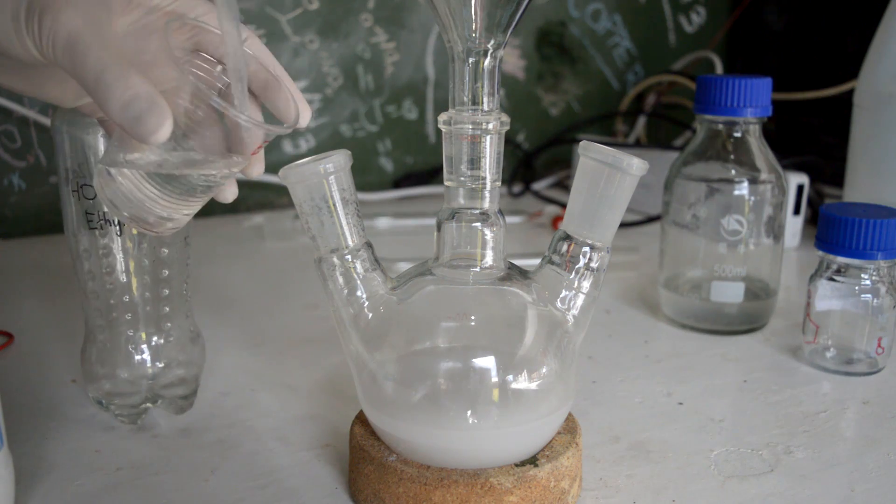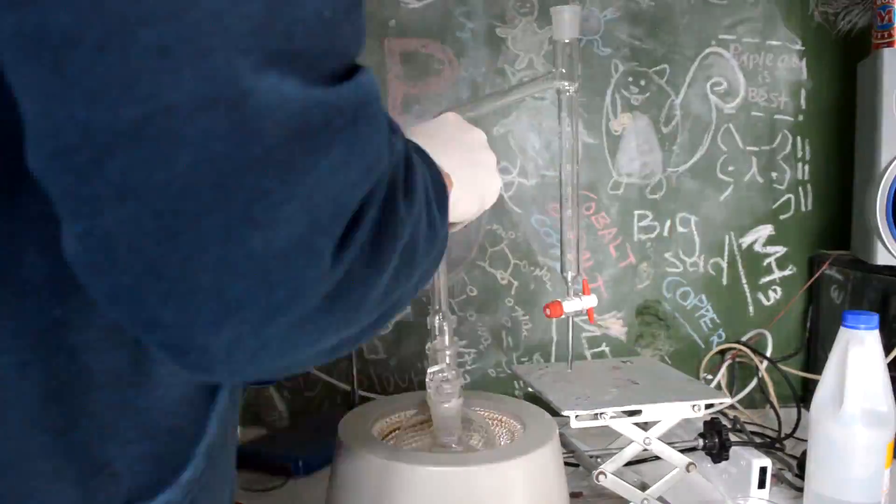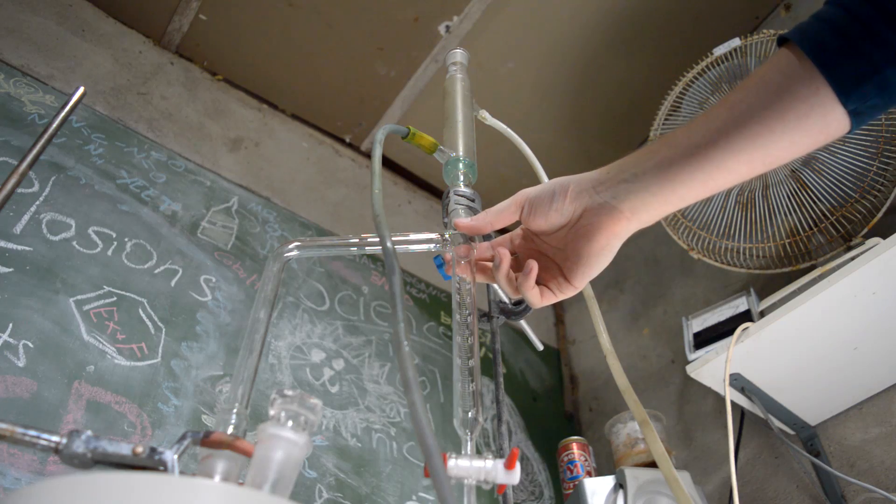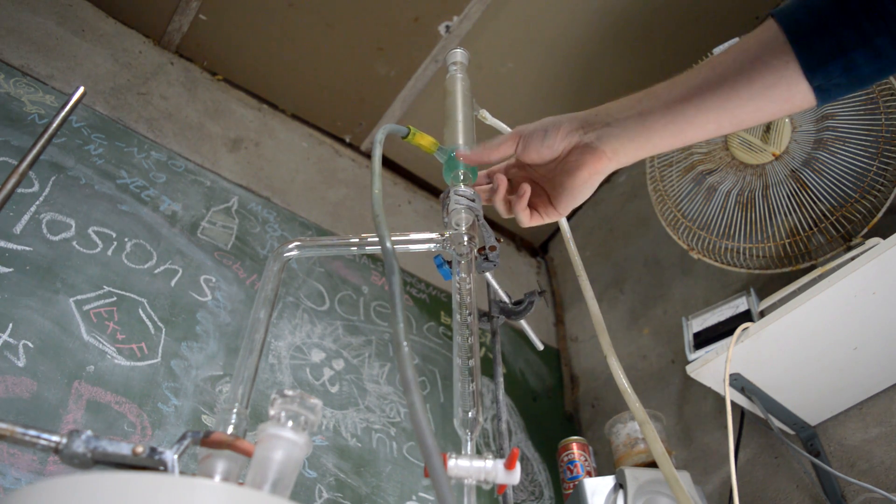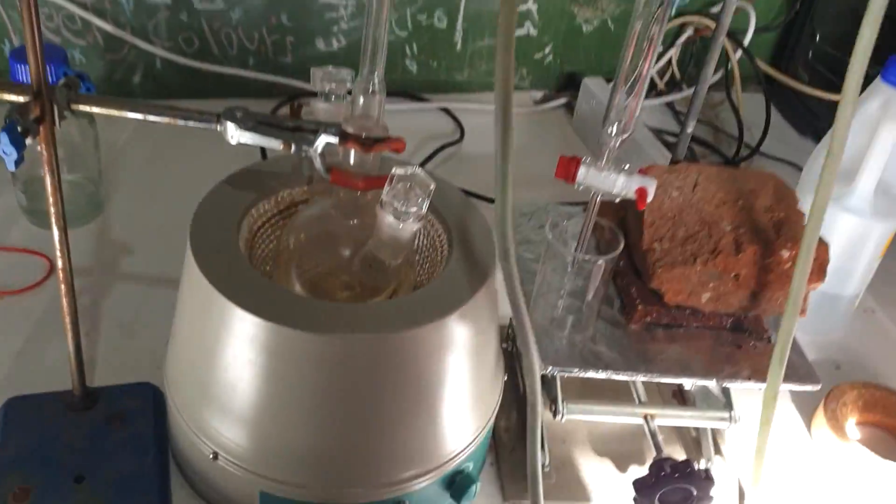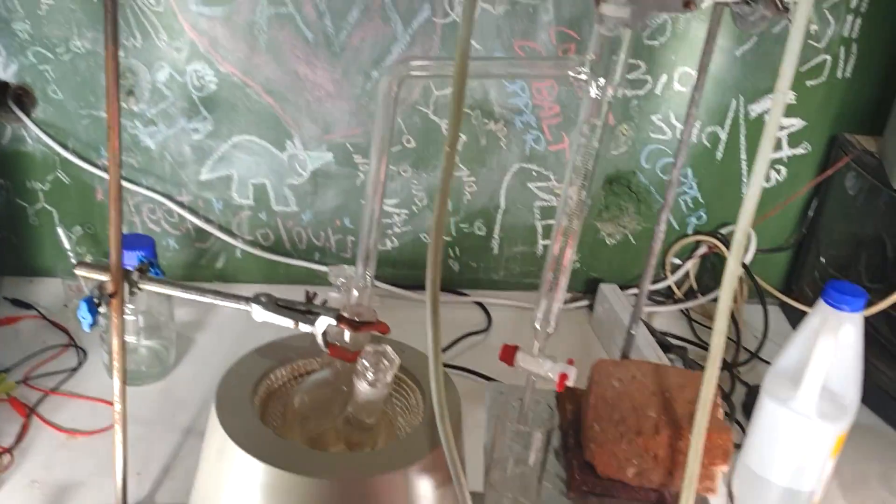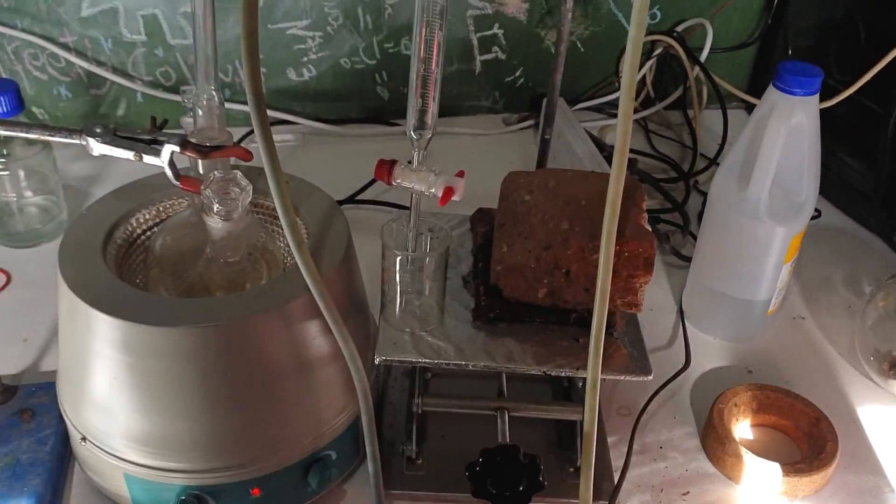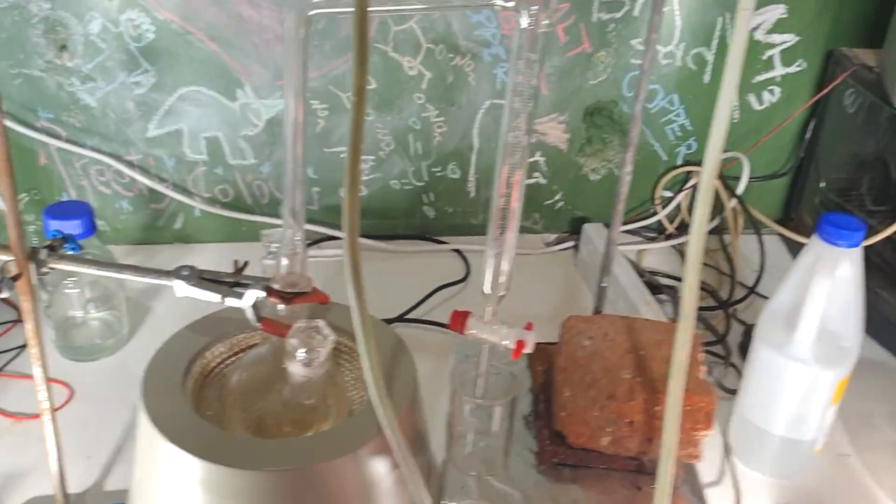Everything's assembled. It's a little scary, but I think everything's clamped appropriately. I've added maybe a third of the ethylene glycol. I said I wouldn't add any, but I've chickened out because now the problem is time. The paper we're following refluxed this for 30 hours while collecting water in the Dean-Stark trap, which means I'll probably do it just for all of today and maybe another day. We'll be able to monitor progress by how much water collects in this trap.